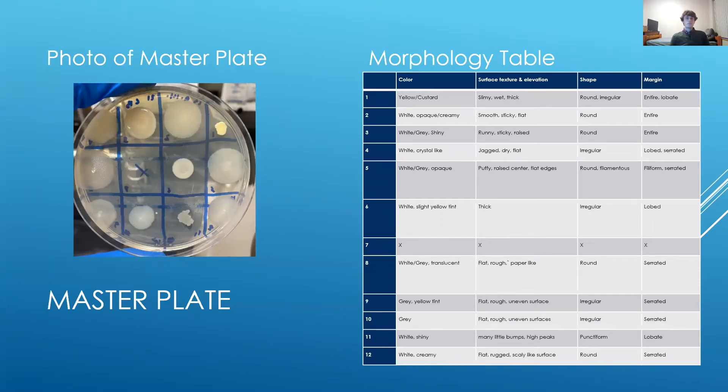After the spread plates were made, colonies were taken from these plates using the pick and patch method. This was a process where the bacteria was picked from the spread plate and patched onto a new agar plate that would become the master plate. This is a plate that will contain all our bacteria organized in one place that we refer to later.